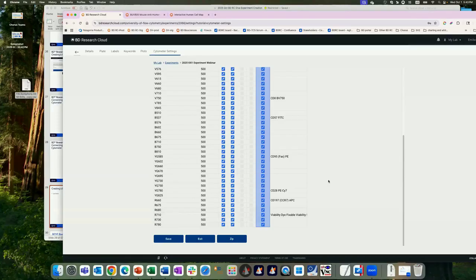It's not a full Diva experiment. And so the workaround for that, from Diva, when you import your BDRC experiment, all you need to do is toggle from the global worksheet to the other worksheet type. You do that once, you just toggle between the two worksheets and then press save, and that's the workaround, and then everything is preserved. So in case you run into that issue, we do have a workaround for that.